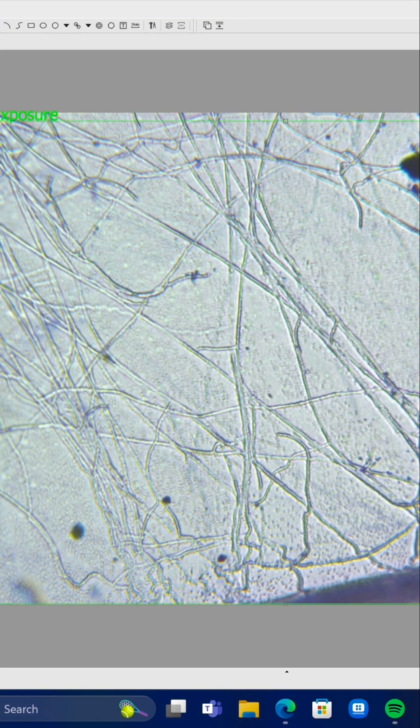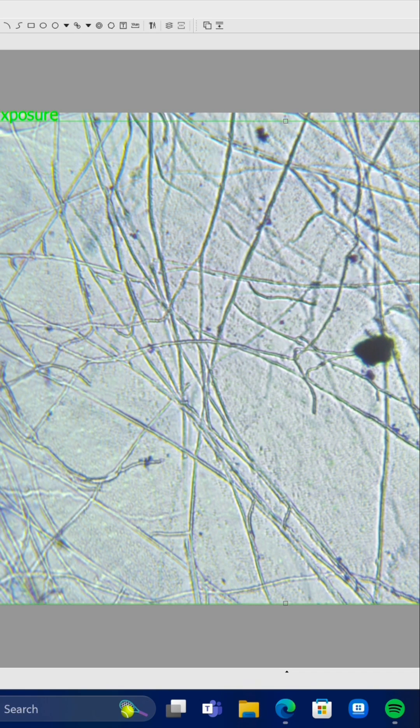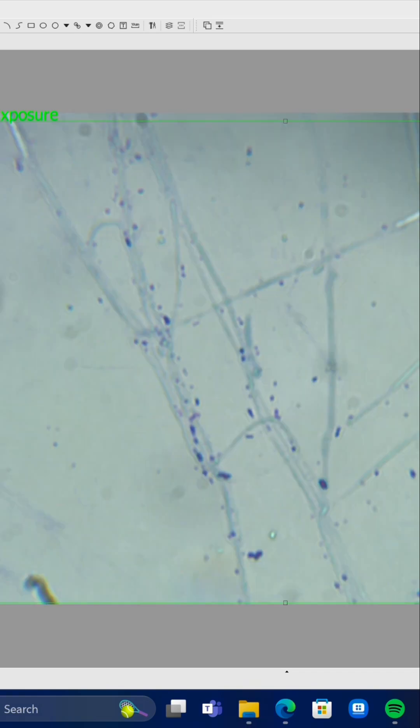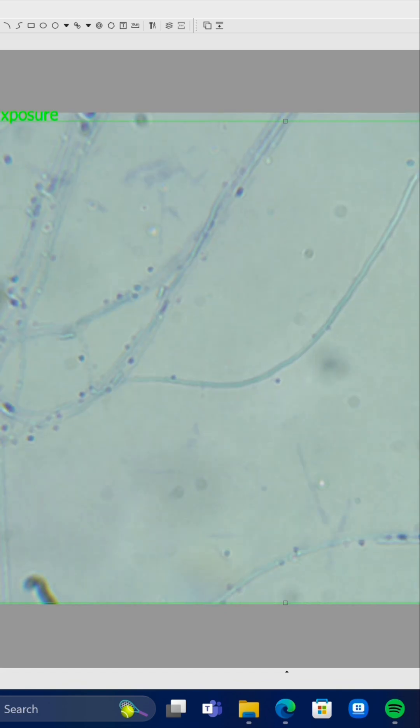Now this second type of microorganism that looks like Transport for London Underground Network is actually a fungi. That network thing is called mycelium, innit? And it contains something called hyphae. And the hyphae absorb and transport nutrients all around the fungi and that, do you know what I'm saying? It's a mad thing, bruv.